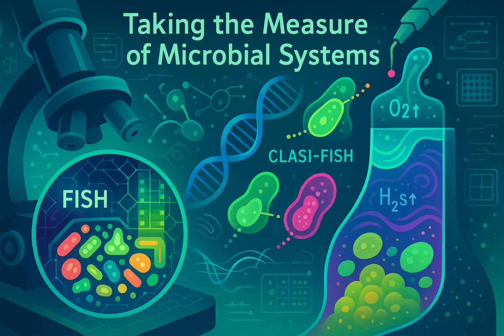And then you have to be really sure it is pure. Oh, absolutely. That's critical. You check colony shapes, look under the microscope to see if all the cells look the same, maybe test growth in different media, see if anything else pops up. Exactly. And nowadays, sequencing a key gene like the 16S RNA gene from the isolate is pretty much standard practice to confirm purity.